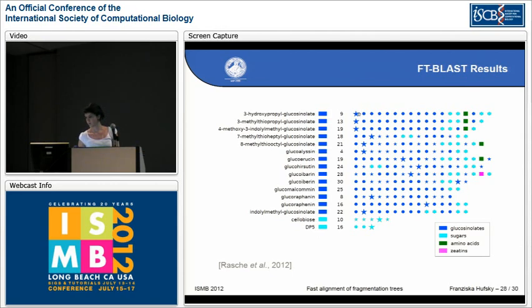And further, there are many stars. Small stars mean structurally similar compounds, and a big star means the most similar compound that was in the database. And this most similar compound was for 30% of the instances at the top position and for 60% within the top 3 positions.